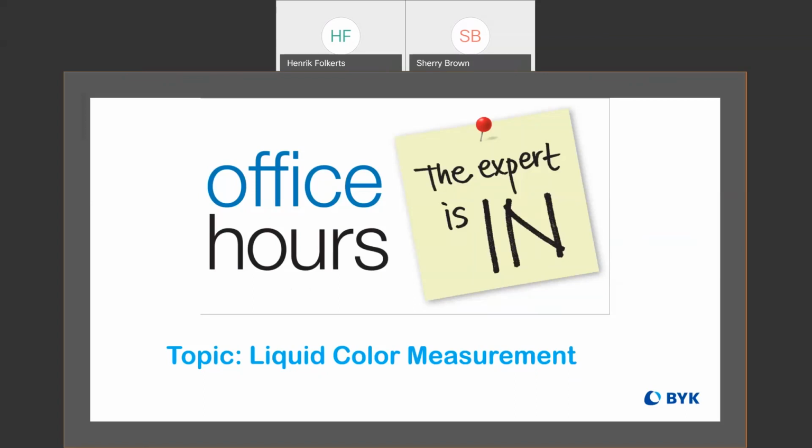So it is necessary to measure such materials at different angles, but in addition to those color measurements at different angles, it can also measure what we call sparkle and graininess. So sparkle is just a measure of that sparkle effect that you get if you're talking about, I don't know, a nail polish with a glitter pigment in it. It can evaluate both the size of the individual particles that provide that glitter effect, as well as the intensity of the flash off of those. So if you want to know more about the capabilities of that instrument and ways in which it might be able to help you measure materials like that, I encourage you to reach out to me via phone or email, and we can discuss it further.